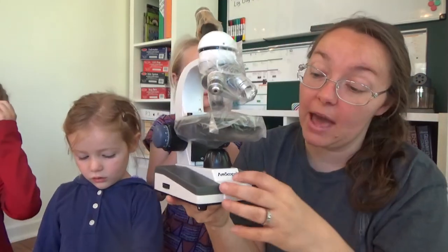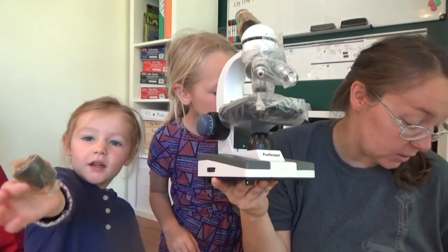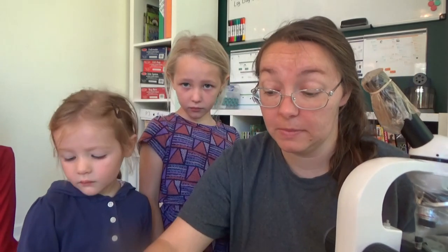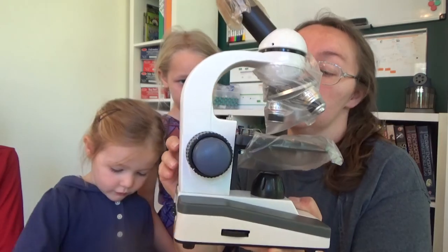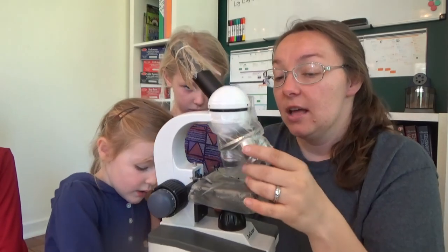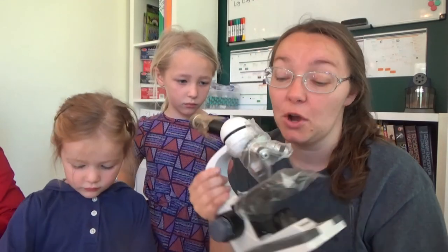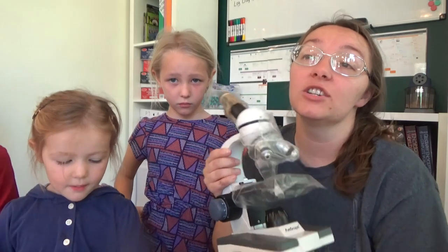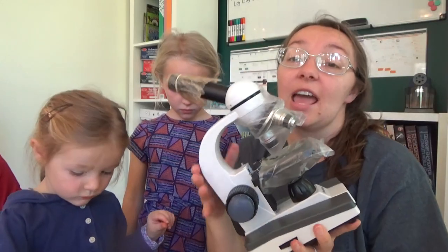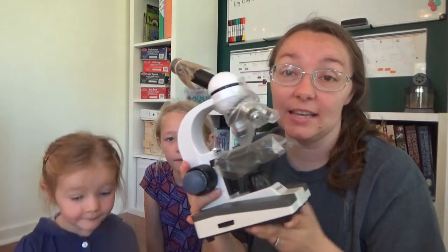It's a battery-operated one so it does come with batteries — looks like three double A's. But there is also a power cord if you're going to be stationary with it. We will probably use the batteries because I have two children and they're going to want to be moving around with it. It does have three lenses so we are going to have a lot of fun playing with this and learning about the microscope.